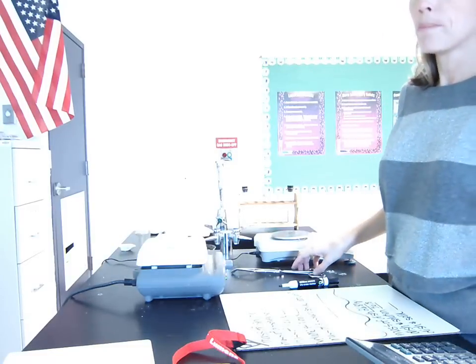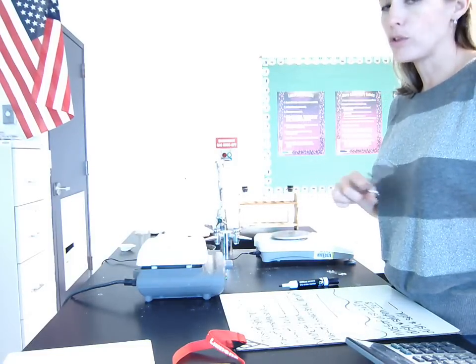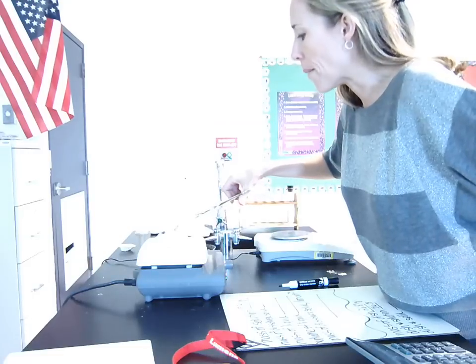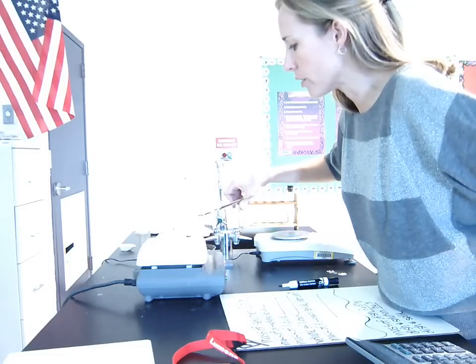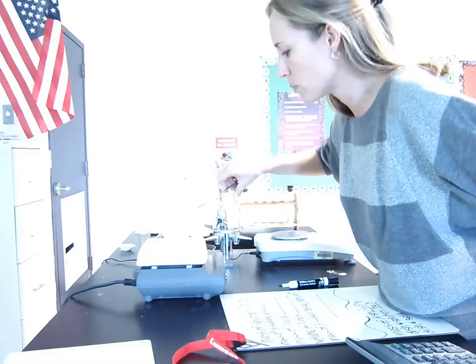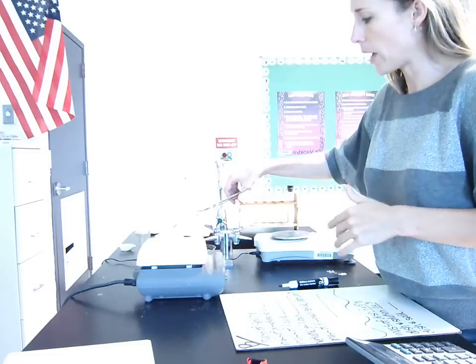We're going to start with B. Hopefully, if you had to fast forward, you can watch. This is the part you need to watch again to get the numbers. Okay. Substance B appears to be drier than substance A. Appears to be totally dry, where substance A looks like it's possible that it needs to dry out a little bit more, so we'll go ahead and work with substance B first, and then we'll come back.